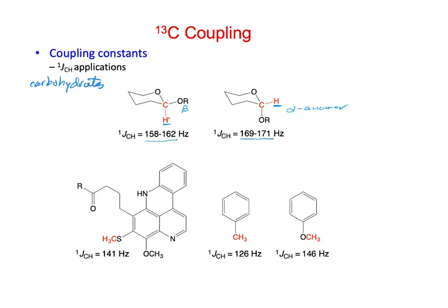Do you know the angles of these ones? Well, it must have to do with how this other oxygen is adding electron density. So there's some change in electron density and bond length and things like this. But if you had a sugar ring like this and you were trying to determine whether it was an alpha or beta anomer, and you could measure that one-bond coupling constant, then that would give you a lot of information. Okay? And so there's two ways that we could determine that.